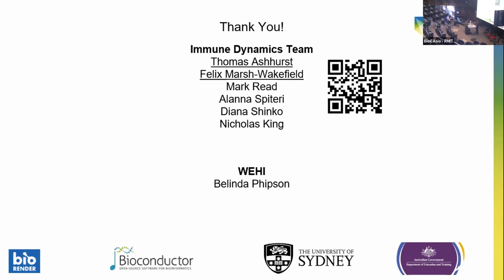Yeah, so Spectre, all the credit actually goes to Tom. This was something he started off as his PhD project. He just needed something that was easy for him to use to analyze his own dataset. And he found it irritating having to interrogate a lot of these objects, like flowFrame objects, importing his data and so on.